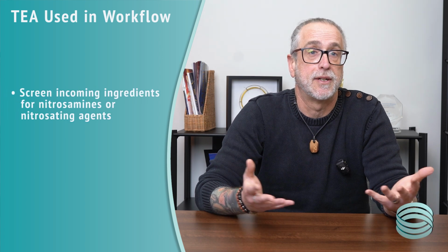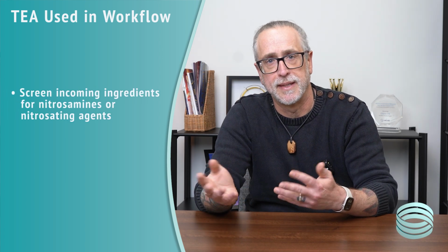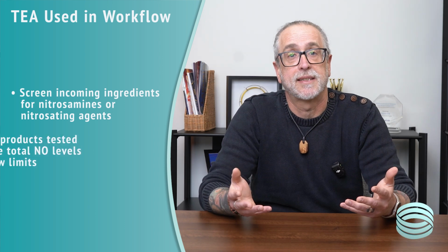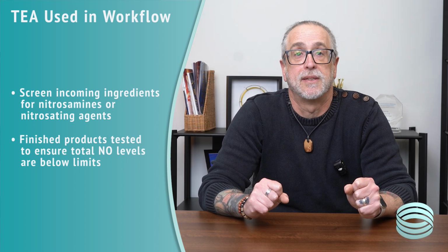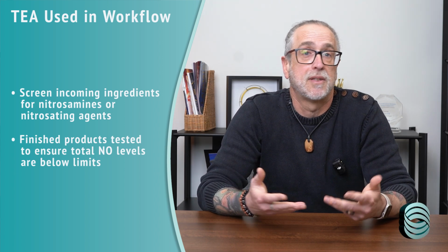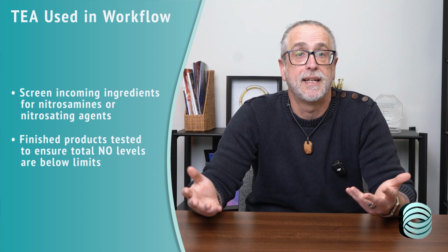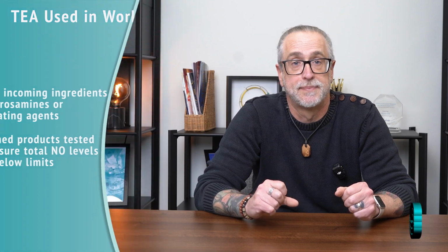It can be used at multiple stages of a company's workflow. For example, incoming ingredients can be screened for nitrosamines or nitrosating agents, which can react with amines to form nitrosamines, before that ingredient ever makes it into production. Finished products can be tested to ensure the total NO levels remain within regulatory limits. If a sample exceeds these limits, further testing methods like GC or LC-MS-MS or GC-TEA can then be used to pinpoint the exact nitrosamines and their quantities.